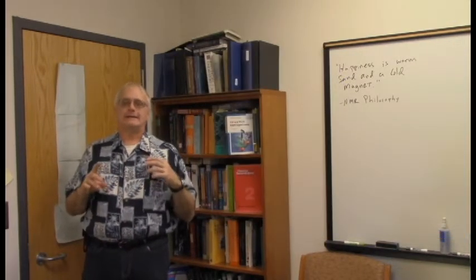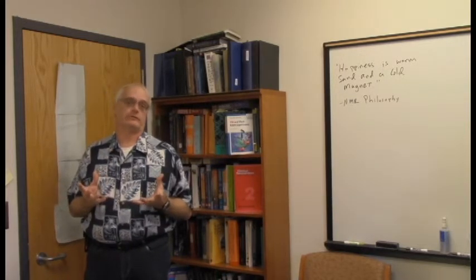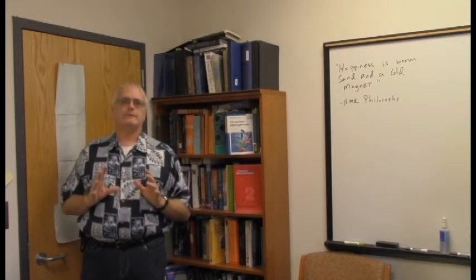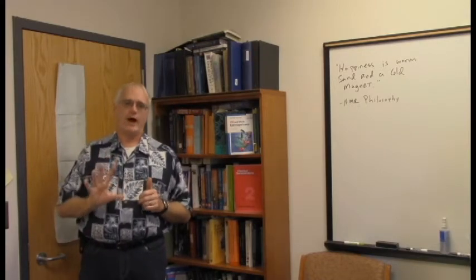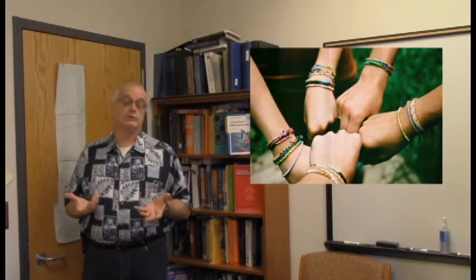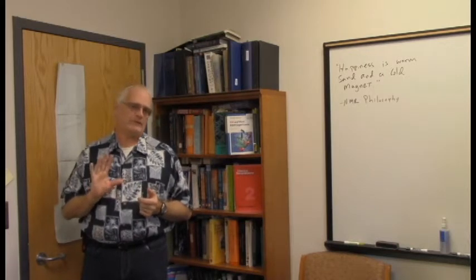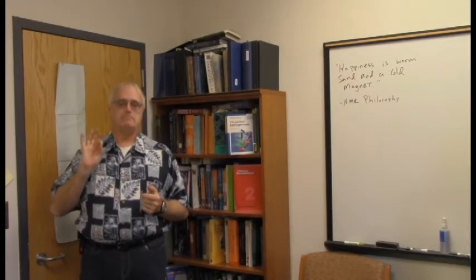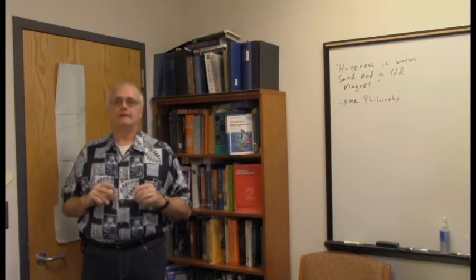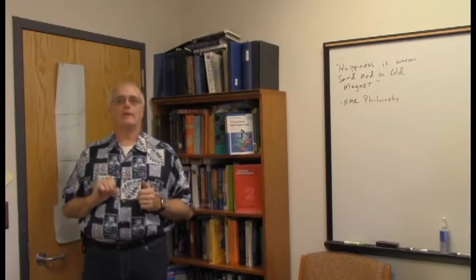And really, for a task like this, for just simply picking a structure out of a lineup type problem, I honestly believe you need to only think about your 5 best friends when you're being introduced to NMR spectroscopy, especially proton NMR spectroscopy. There's really only 5 regions that will get many of these types of problems answered pretty readily. It ought to solve at least 80% of them that you're likely to encounter. And so I want to emphasize these 5 regions, what they tell us about.